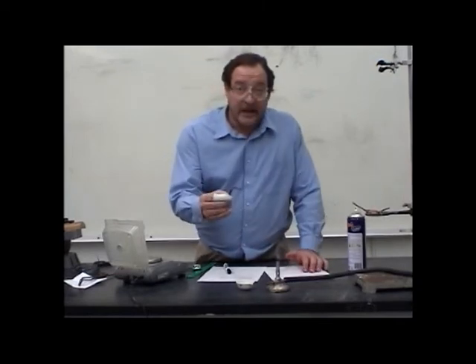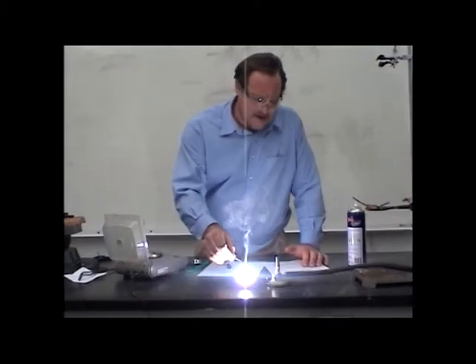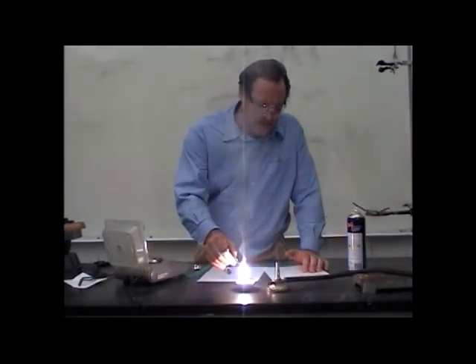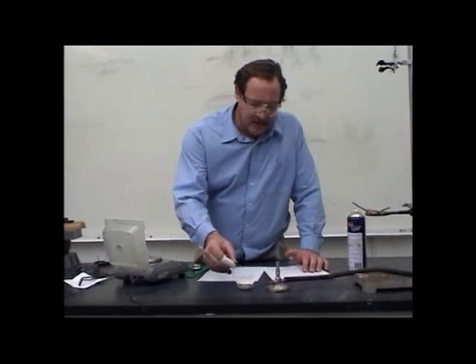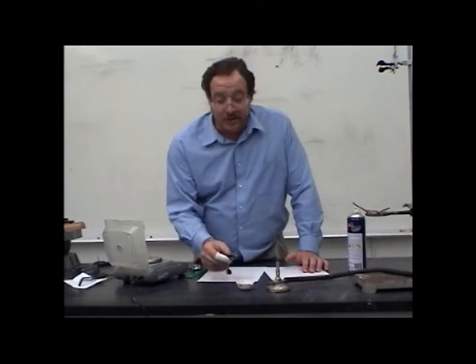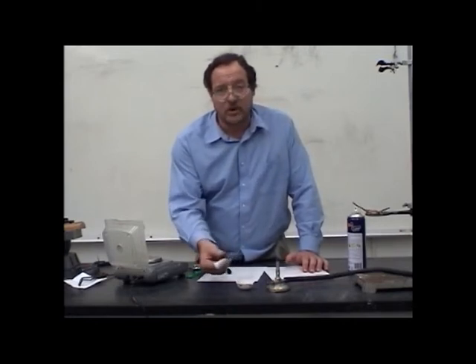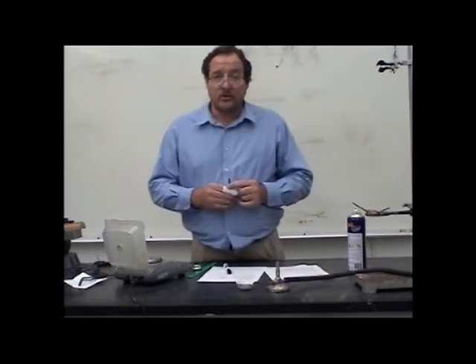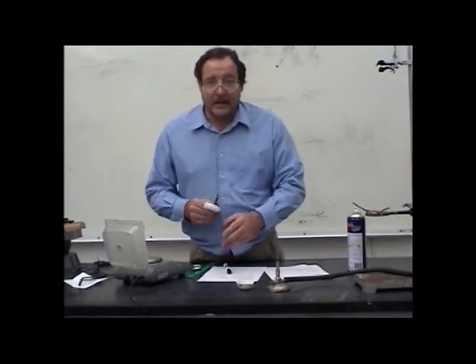Okay, and again, don't stare at it. So I hold it there, I light it, and I'm going to hold it above. Again, watch what's happening, but not the flame. Note certain things that you see, and then carefully set it in there. Be as careful as you can, because if some ash falls out, that would be a source of error, which would show why you're producing a lower percent yield than what you theoretically should get. If you spill any, make sure that you note that.